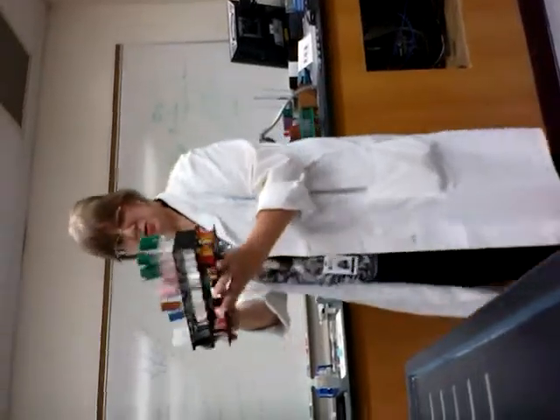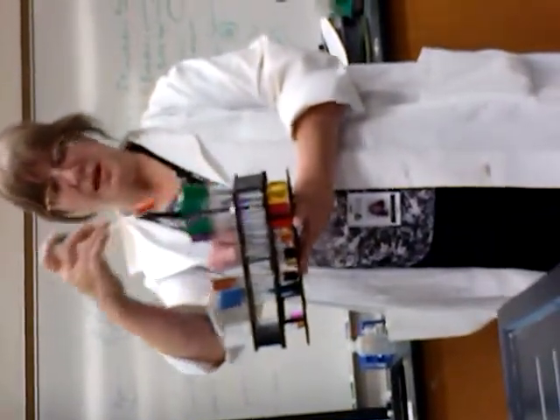We're going to go down in a minute. Okay. Don't confuse the phenol red broth test with an added carbon source with the methyl red test, because they are absolutely opposite. The phenol red test starts off sort of red or red orange.